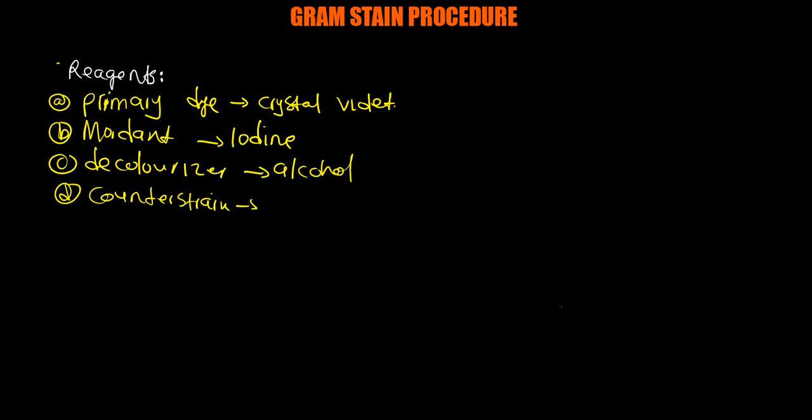Okay, so it will be using safranin. So these are the things, so know them in this order, please. Know them in this order, please.